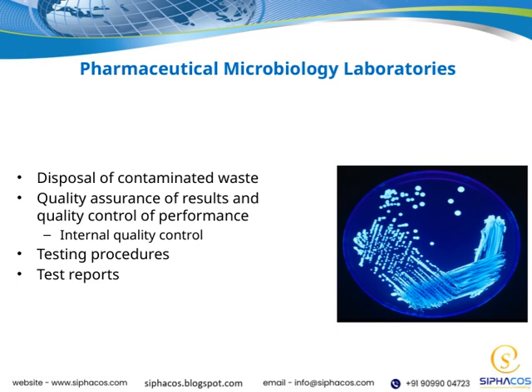Lastly, test reports are the final product of our efforts. They must be clear, accurate, and comprehensive, serving as a solid basis for decision-making in pharmaceutical quality management.